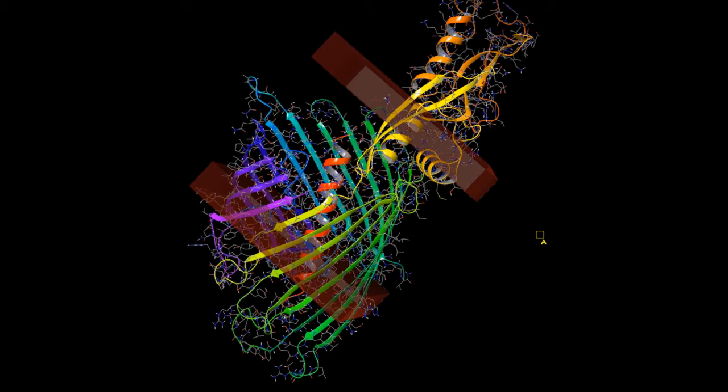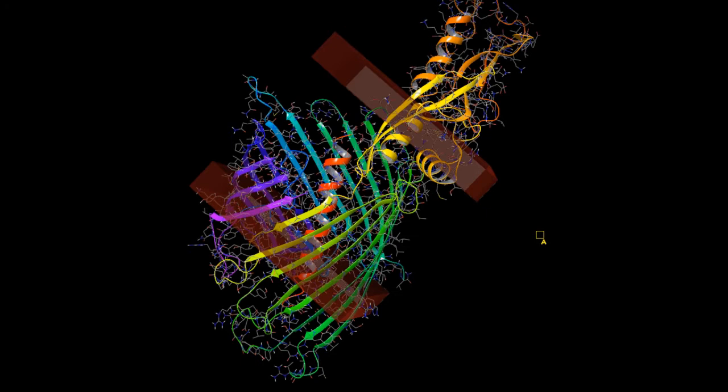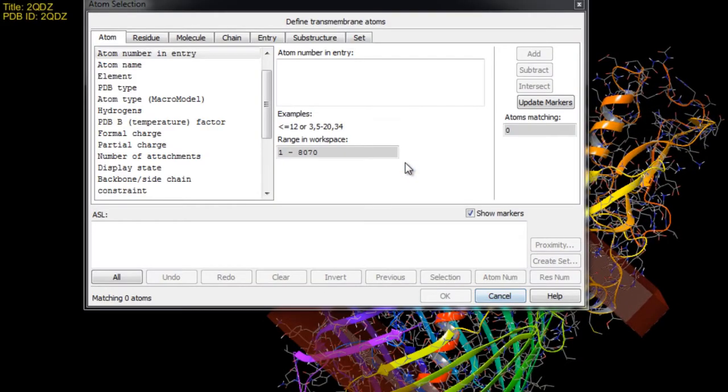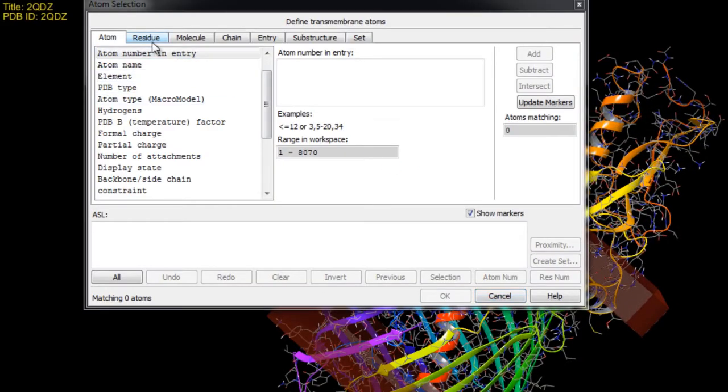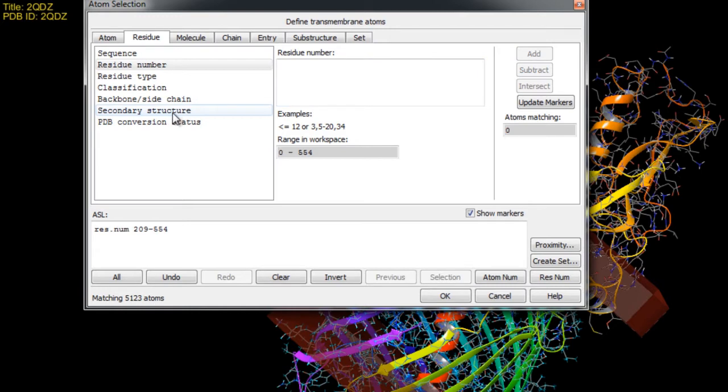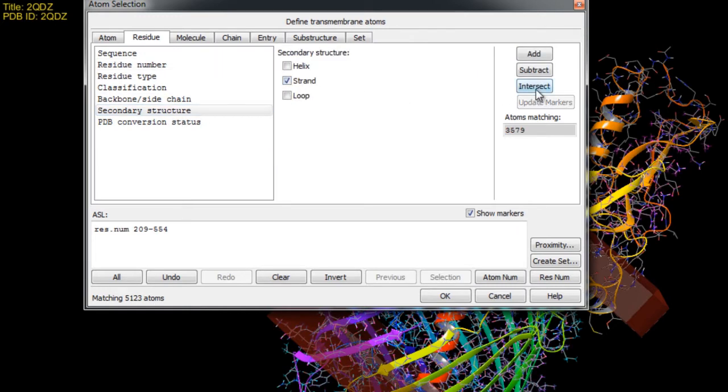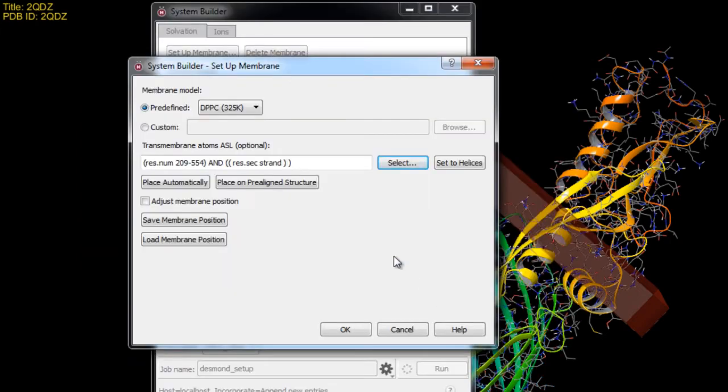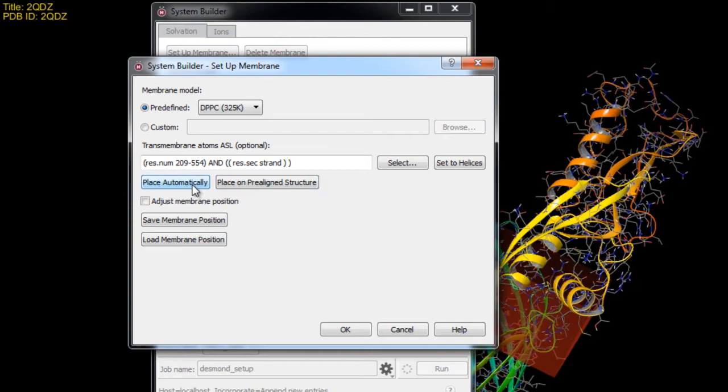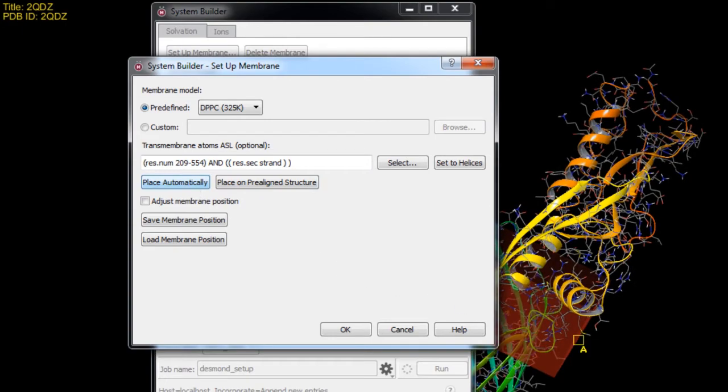So we'll need to select the residues in the membrane manually. We'll just click select then in the residue tab we'll specify the residue numbers as 209 to 554 then click add. Then we'll choose secondary structure and select strand then intersect. Now this expression indicates that the atoms to be selected are those that are between residues 209 to 554 and have a strand secondary structure.